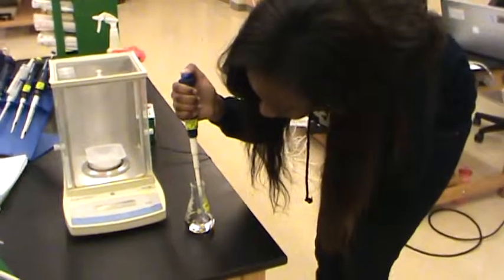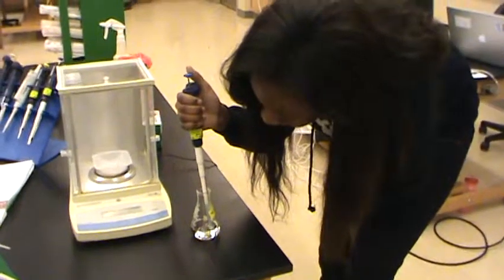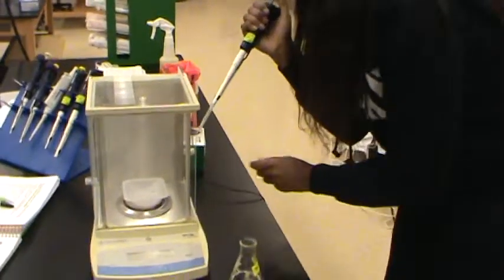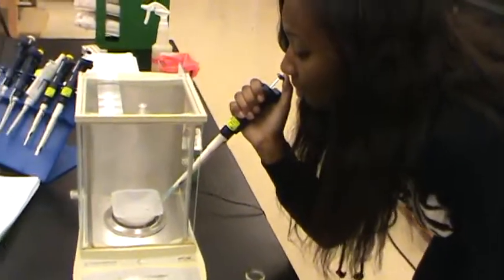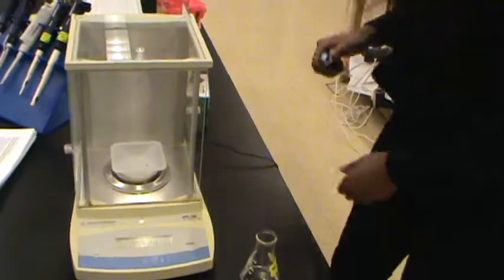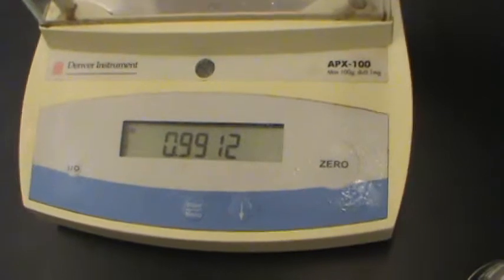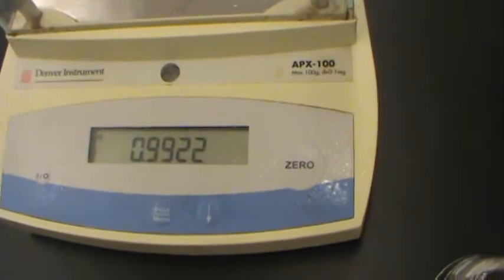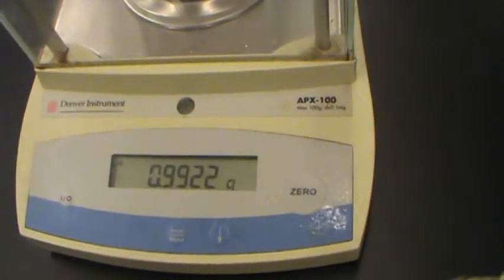She is trying to take one thousand microliters of water accurately using a micro pipette. She only pushes it to the first level, but when she squeezes the water out, she will push all the way down. This is about 990 microliters, and using a 1000 pipette, that's pretty accurate.